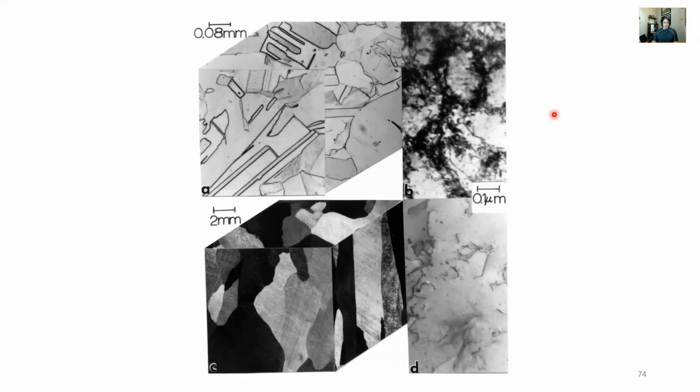Again, just kind of showing an example of using optical microscopy in conjunction with TEM. So these are from the materials I did for hypervelocity impact. So we have this oxygen-free high conductivity copper. It's kind of equiaxed grained. It has dislocation cells, so dislocation density is pretty high. So we have two things working in favor of hardness and yield strength. So kind of a small grain size relative to this copper, both copper.